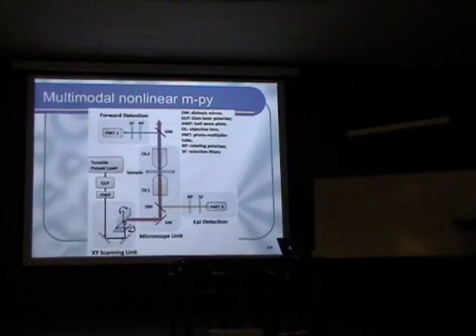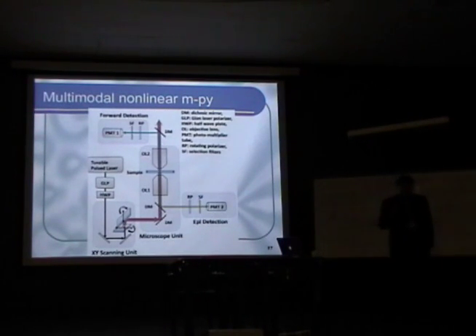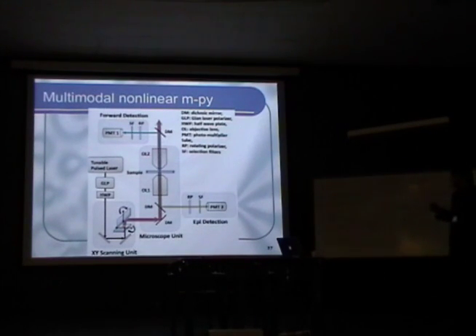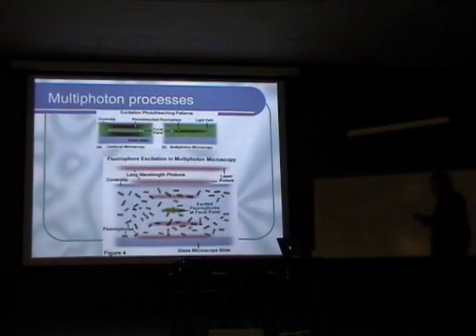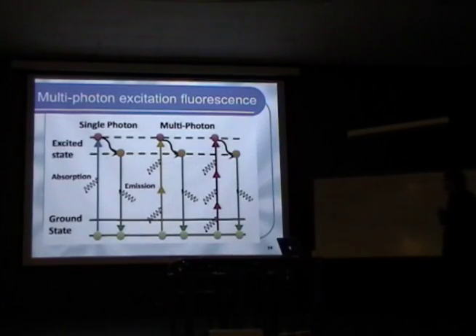The very same system, however, that I show in here can be also used to do imaging in other nonlinear optical microscopy modes. And the second one that I want to discuss will be the second and third harmonic generation microscopy. So I'll discuss it in a couple minutes from now.